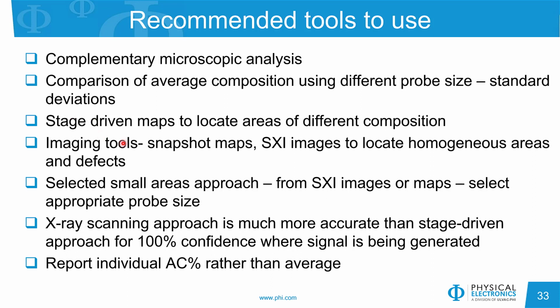Imaging tools that are available in situ with focus on SXI images because it's probably one of the most powerful features of our instruments. Once we have those images, we can use selected small area approach, and then we need to remember to keep in mind the relationship between the feature and the probe size, that you have always to use 3 times smaller X-ray beam size than the feature that you would like to selectively analyze.